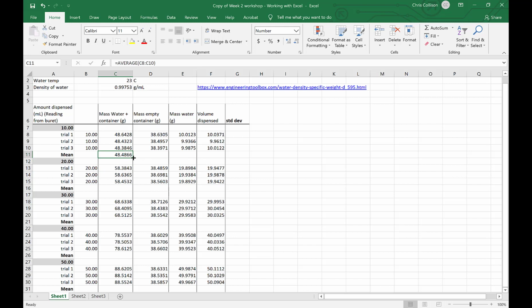Another thing I can do here in Excel is drag across. So there's my dragging across, and I've got the average of the arguments, that is the 3 cells above, the mean value. So there was the average. Let's repeat down here again and demonstrate how I did this.